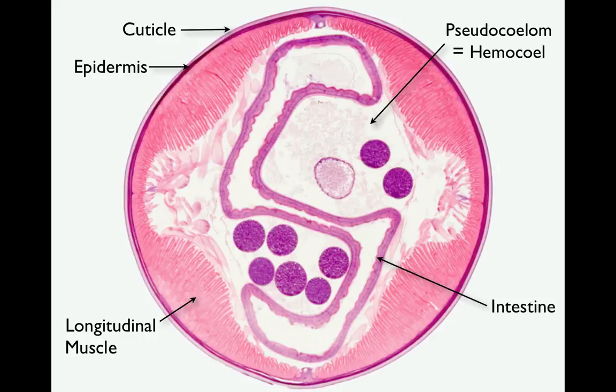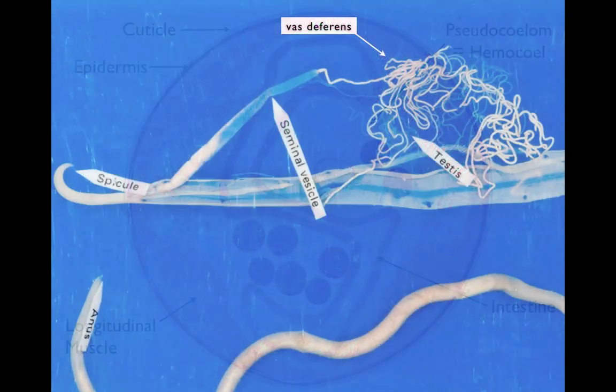The other structures that you can see - these dark purple structures here and here, as well as this lighter structure here - are all part of the male reproductive system. To better understand what you are looking at, let's take a look at a dissected specimen of Ascaris. This is available to you in the laboratory.